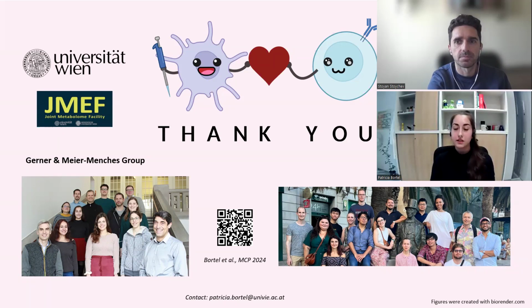Okay, so we didn't check doing fewer washing steps because on the Kingfisher, the washing steps and how they are made are already so efficient and fast that there is not really a need to scale down on the washing steps. Also, the enrichment is very fast. But definitely when I did the enrichment manually, I saw that when doing fewer washing steps we got more unspecific binding. So for the manual workflow, it can definitely matter. But for the Kingfisher here, we didn't test scaling down the washing steps.